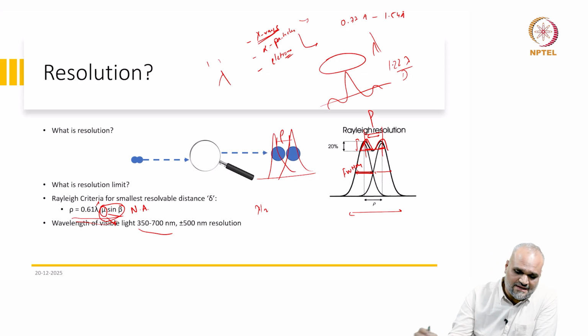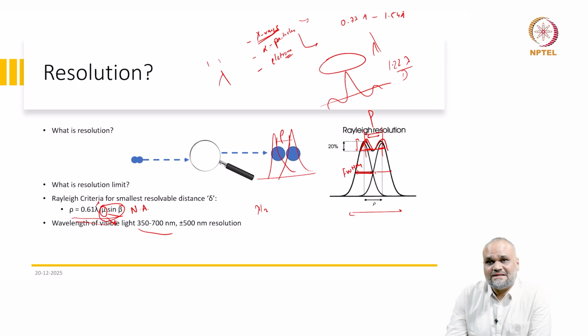Looking at all the available options, by the way, there is something called scanning transmission X-ray microscopy as well, where you have a lens system or an imaging system coupled with a high energy X-ray source, and you can use it for getting finer details beyond the optical limit.